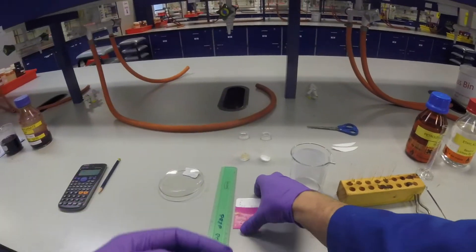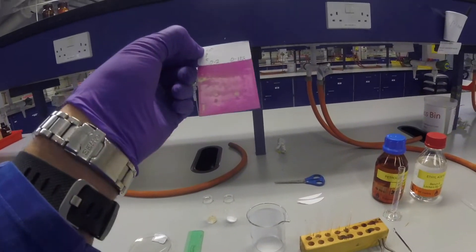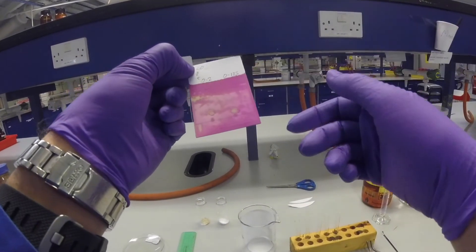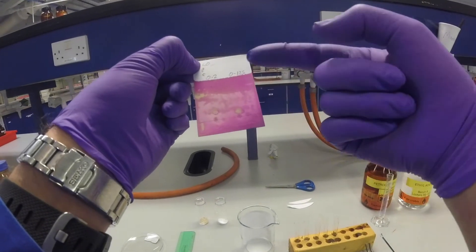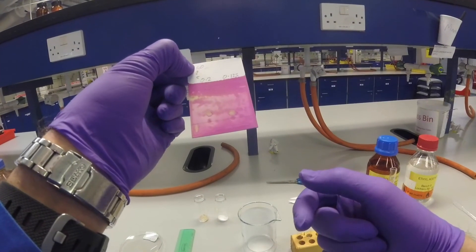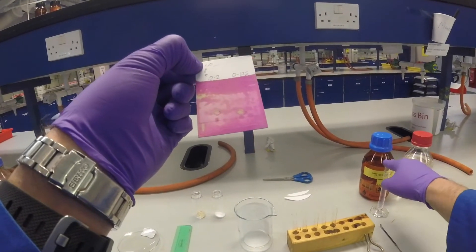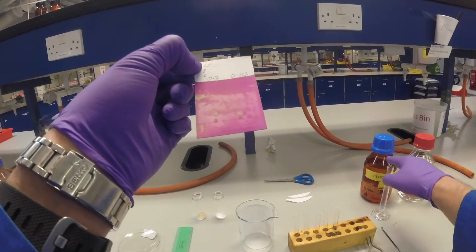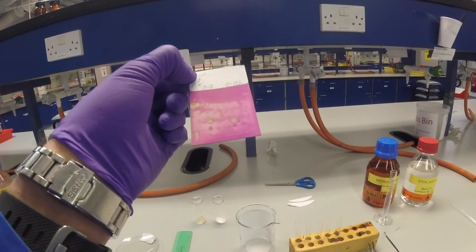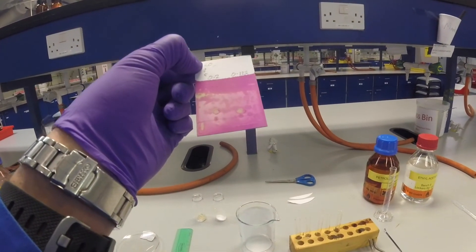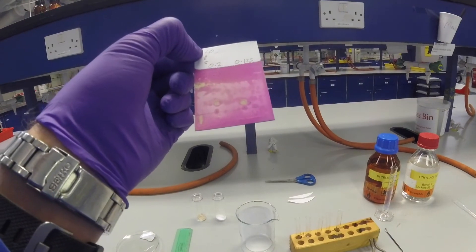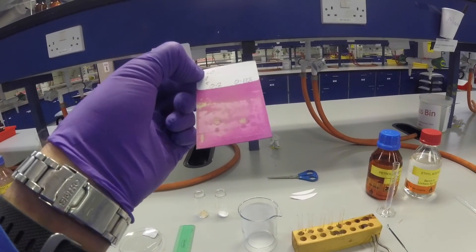In your lab book, the important thing to do is draw out a sketch of your TLC plate, say what the retention factor is for each of those spots, say which solvent system you used—in this case 50-50 ethyl acetate petrol—and also say what visualization technique you've used in order to visualize your spots and see where they are. So hopefully that will help you with TLC.